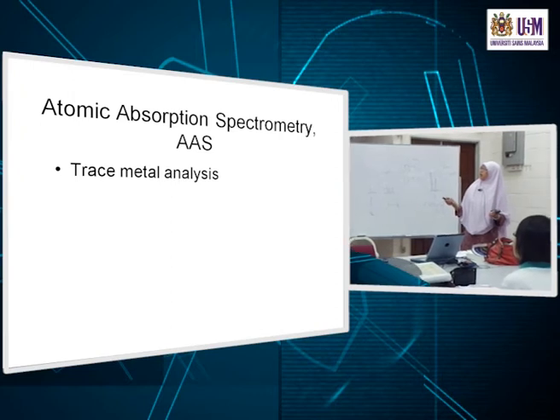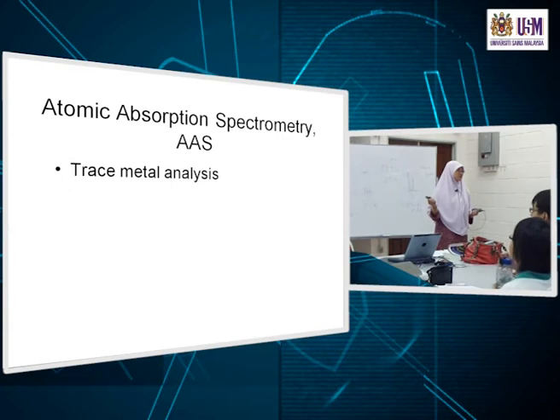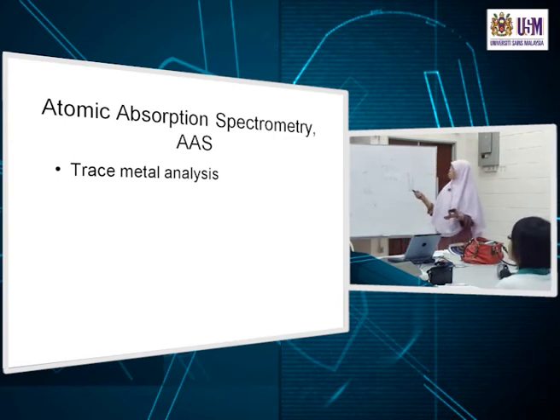Be very familiar with this acronym, AAS, atomic absorption spectrometry, spectroscopy, okay? Maybe you should go and look up what's the difference between the two. Or sometimes we can use it synonymously, interchangeably, spectroscopy and spectrometry. Although some books, some people might be more particular in the usage of the word.